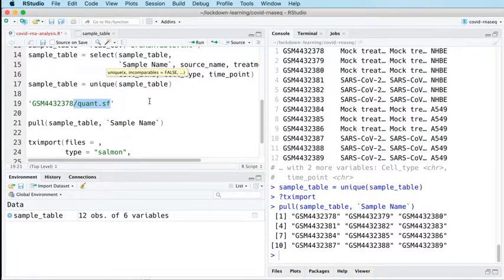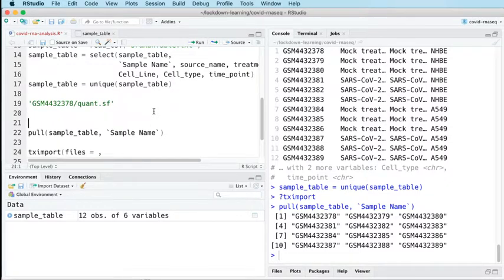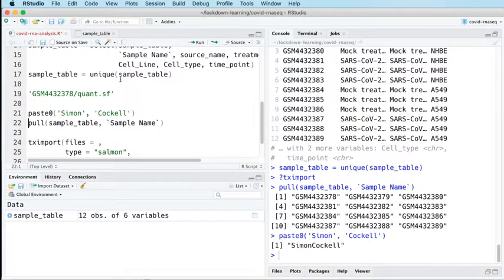And we can do this using a function that we've already encountered in my 2 or 3 days of introduction to R. That function is paste0, which, if you remember, sticks together strings into a single character, and if one of the elements, or even both of the elements here, is a vector, then it sticks the second argument to all of the things in the vector in the first argument.